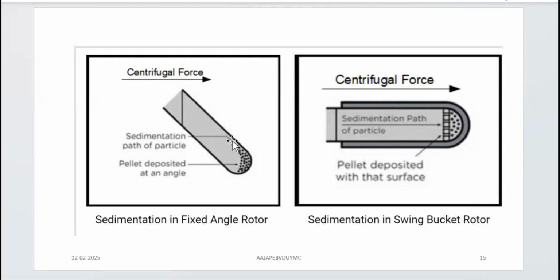Like here you see some particles are settling, they are away from the center, away from the solution, going to the outer wall. They move a short distance before they reach the outer wall and collide with it, and they will then precipitate, right? So a region of high concentration is going to get formed, because particles are moving out, sliding down a short distance and precipitating. You can imagine the concentration is going to build up at particular regions, right?